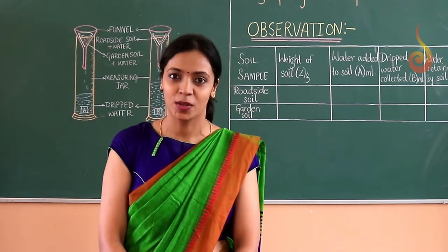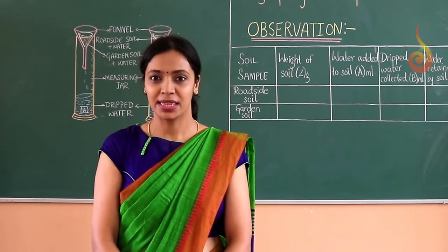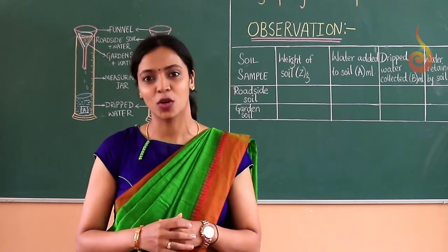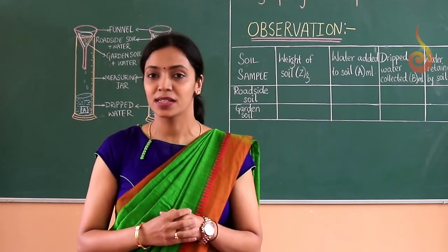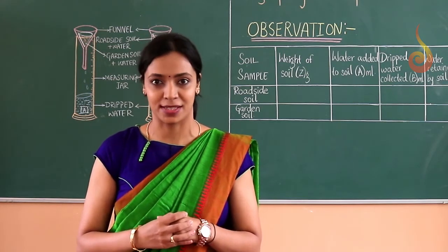In today's session, we will learn about the water holding capacity of soil. In this experiment, the aim is to determine the water holding capacity of the given soil samples. Before we begin with the experiment, let us first understand what water holding capacity of soil means.